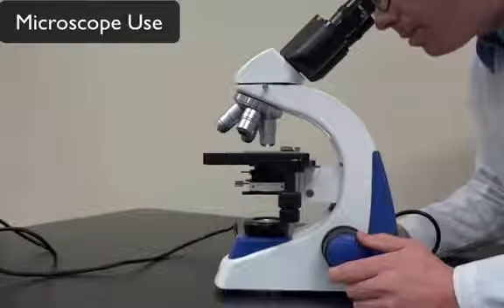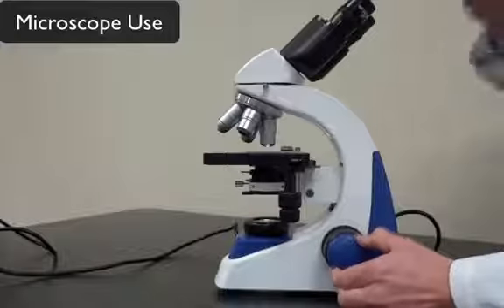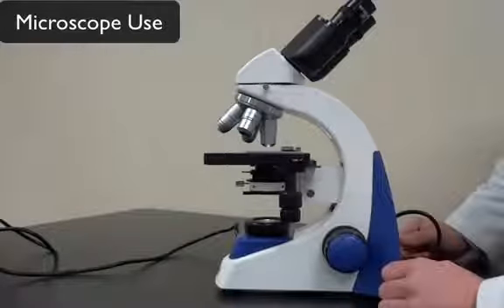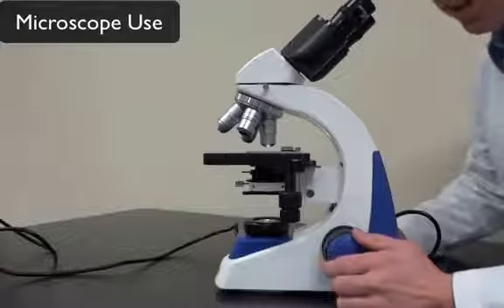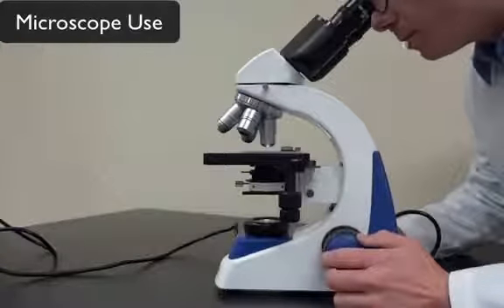Now it's going to look blurry again, and what you need to do is use the fine adjustment dials, not the coarse. So you only use the coarse adjustment in the scanning objective. Outside of the scanning objective, you use the fine tune adjustment here. On this microscope, it's the purple.